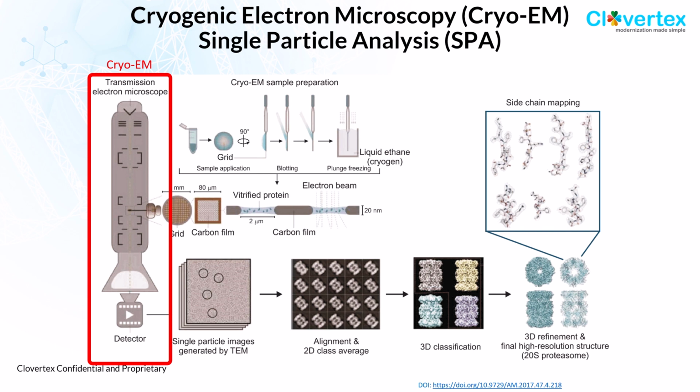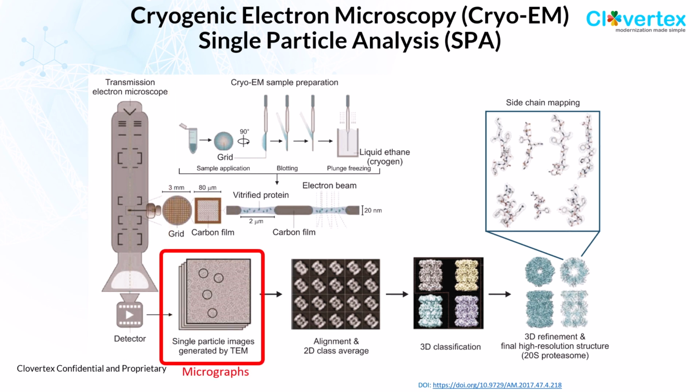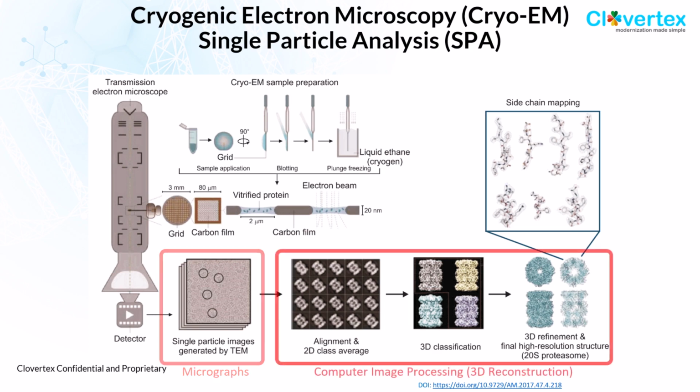Using this equipment, we can get these images we call micrographs, and recently it became possible to take movies of micrographs. And each micrograph contains many protein particles, and all the particles belong to the same kind of protein. That's why we call it single particle.